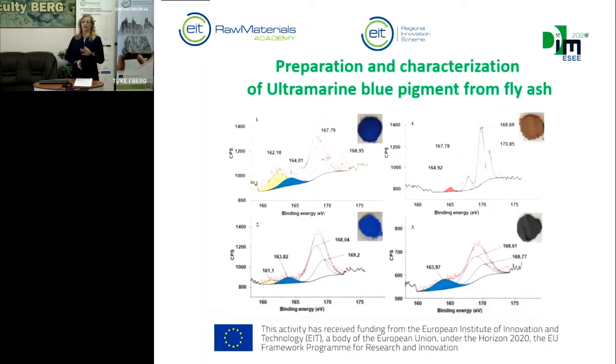The other two samples: one of them was red and one of them was gray. In the red sample we confirmed the red chromophores, and in the gray sample we confirmed only the blue chromophores. There were no yellow chromophores, and the final color of the sample is gray.